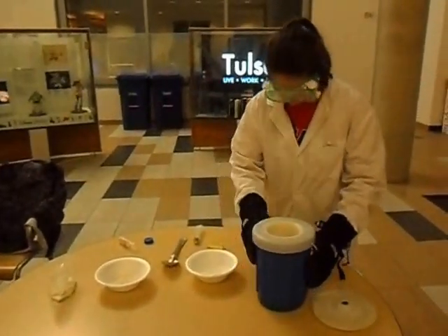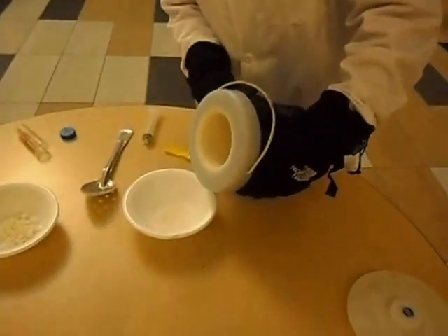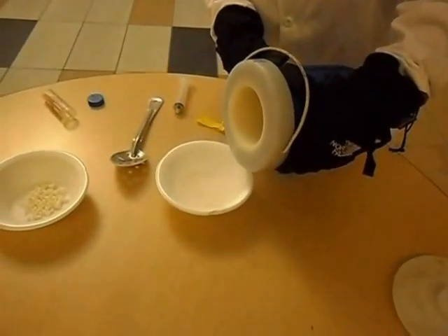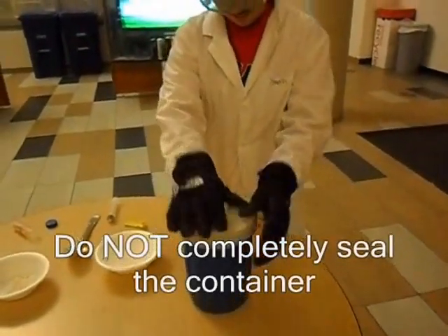Use Dewar flasks or other rated equipment for long-term storage. For pouring it out, Styrofoam will work just fine. We are going to pour out our liquid nitrogen into the bucket. Make sure you recap your liquid nitrogen container.